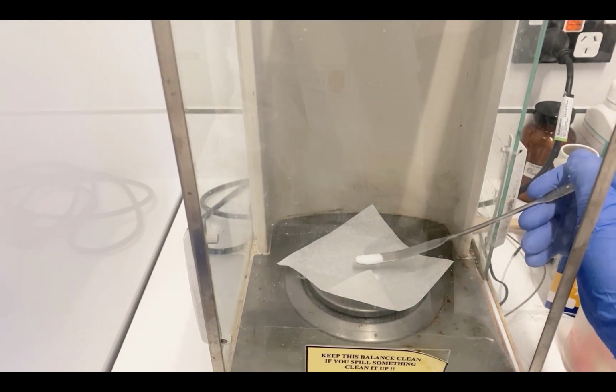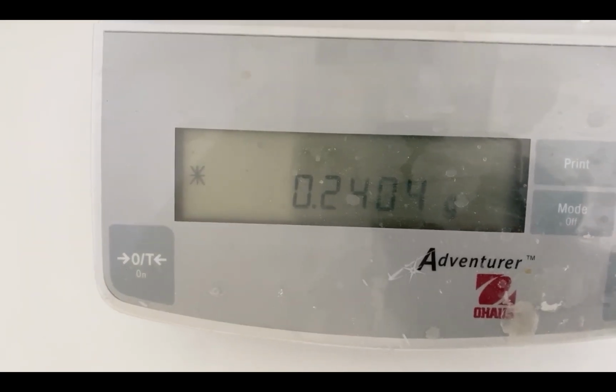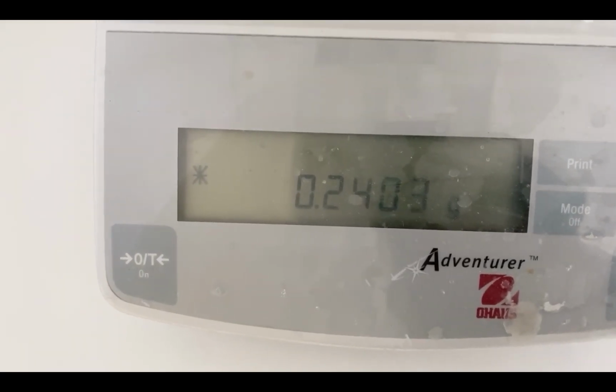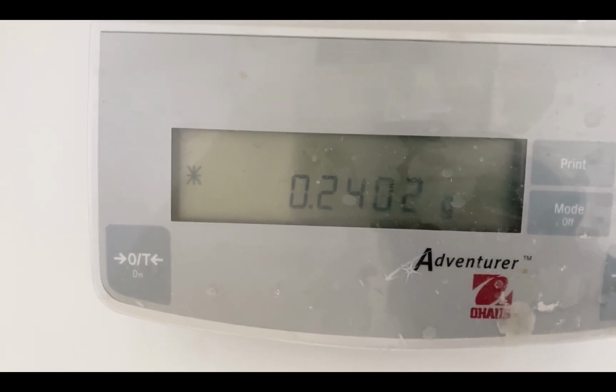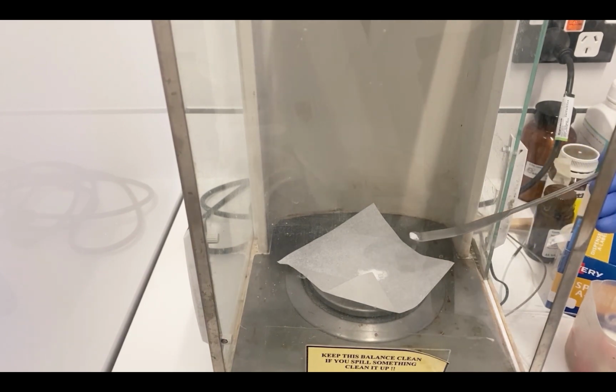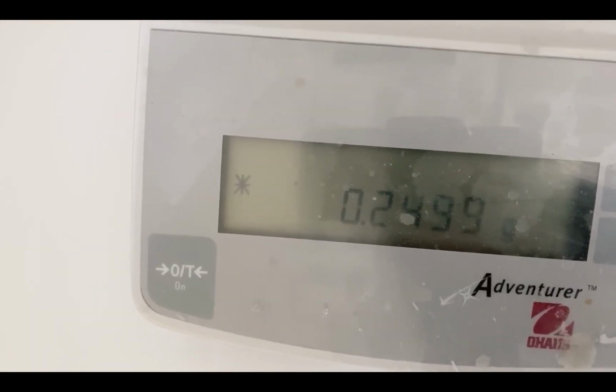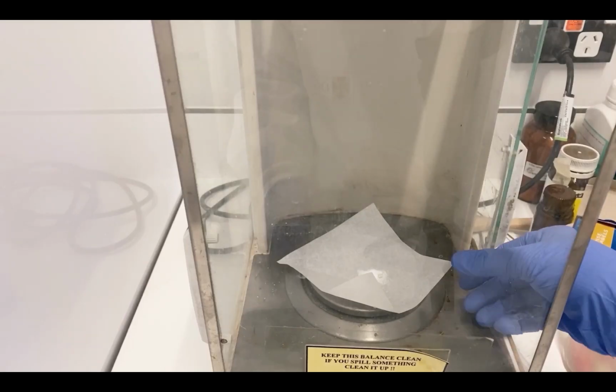Starting with glucose, carefully transfer 0.25 grams of glucose onto the center of the weighing paper. Allow the balance to stabilize, ensuring the reading on the display is accurate and steady. Record the measured mass of the solid sample.